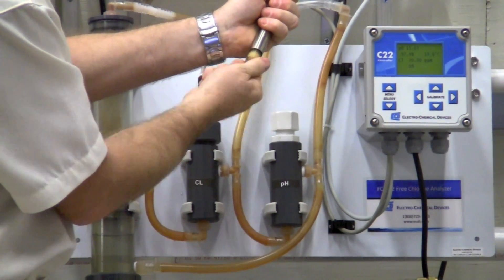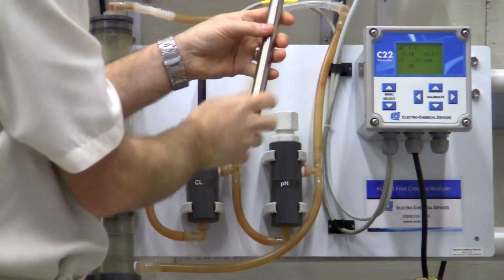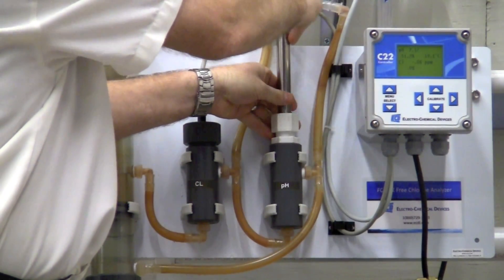Screw the replacement electrode into the sensor housing, perform a two-point calibration as we talked about earlier, and then install this back into the flow cell.